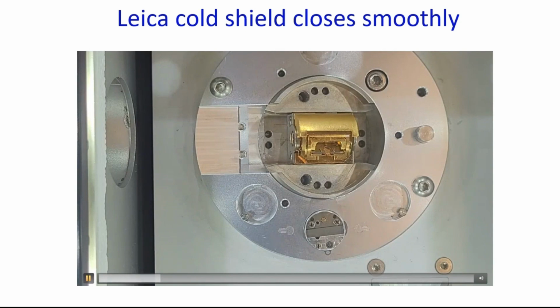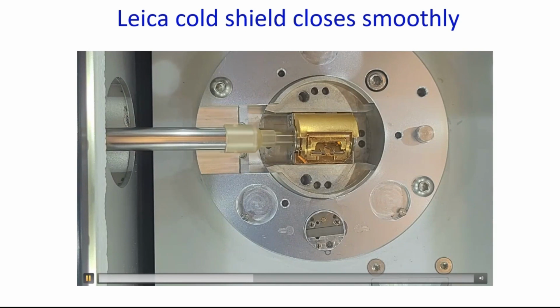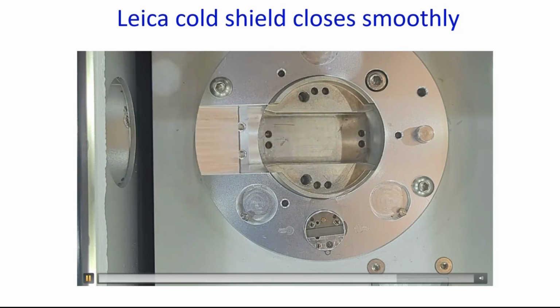And so this is where the VCT transfer arm slides into the carrier, and it can close the shield and then whisk your carrier away and pump it down under vacuum, and it is now protected. And this little innovation has really made our lives so much easier when it comes to conducting this workflow.